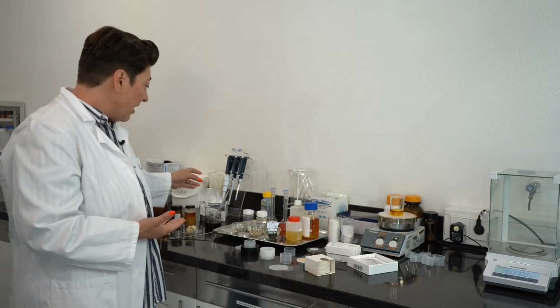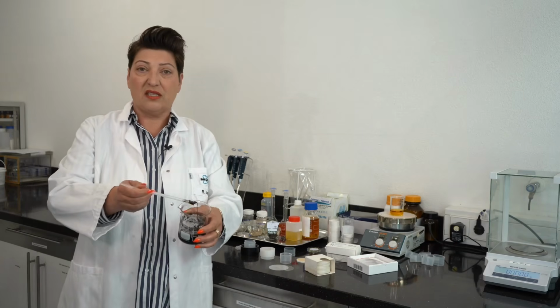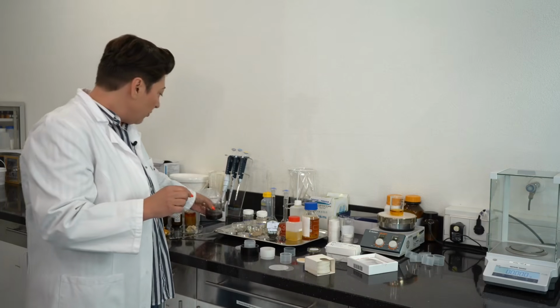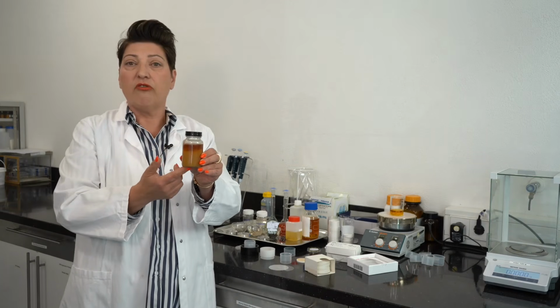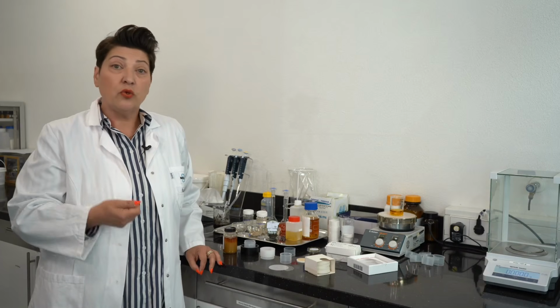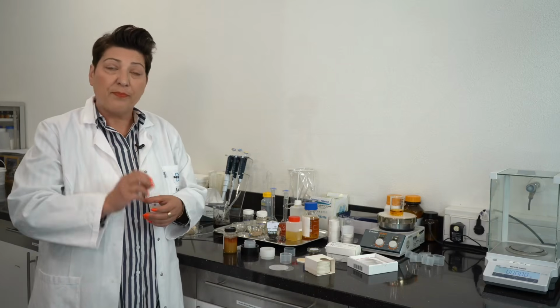On the other side, you also have to take care of the sample itself, especially if you have inhomogeneous samples. If you have particles inside, it can happen that you will have two kinds of phases, like shown here with this used cooking oil sample. You can clearly see there are two phases. So you have to make sure that you homogenize your sample and that you prepare it quickly, that you do not keep it on the desk for a few minutes. Just prepare it quickly, homogenize it, put it into the system.